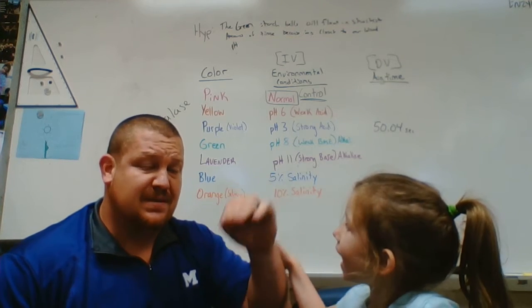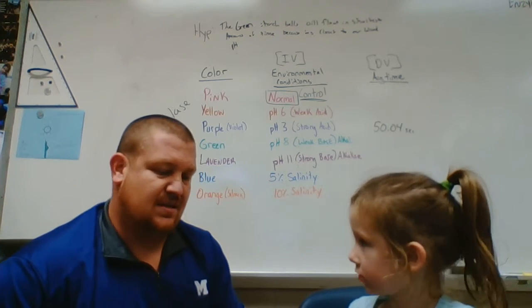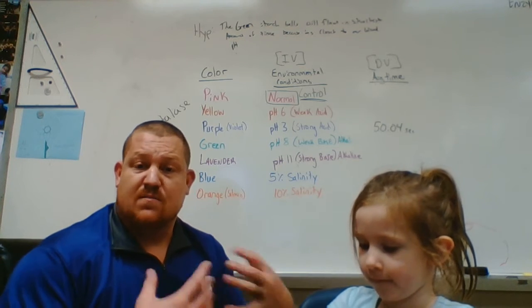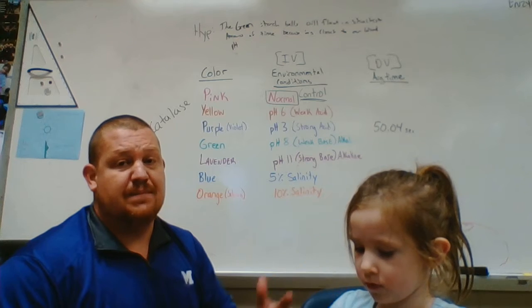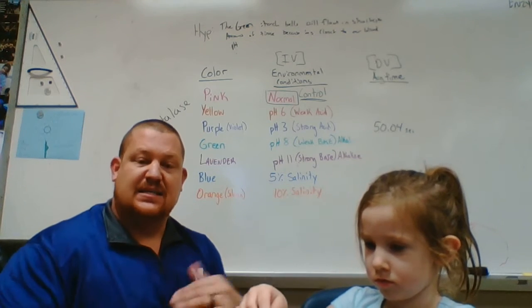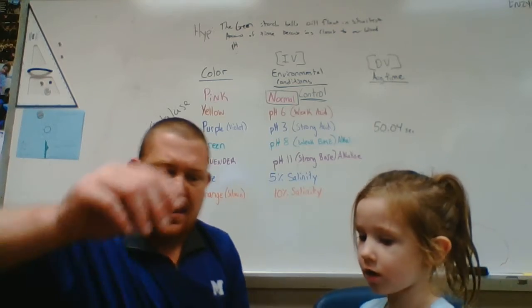The faster that happens, the better the enzyme's working, the more active it is. The longer it takes for that to happen, the more denatured the enzyme, the protein is, and it's not going to work as well. All right, so you ready, Ro?